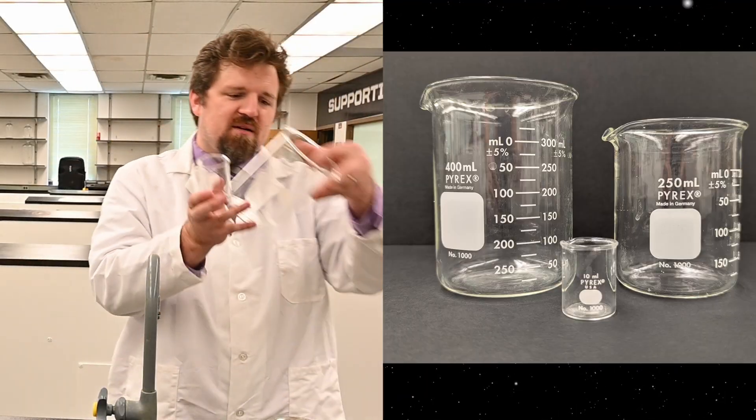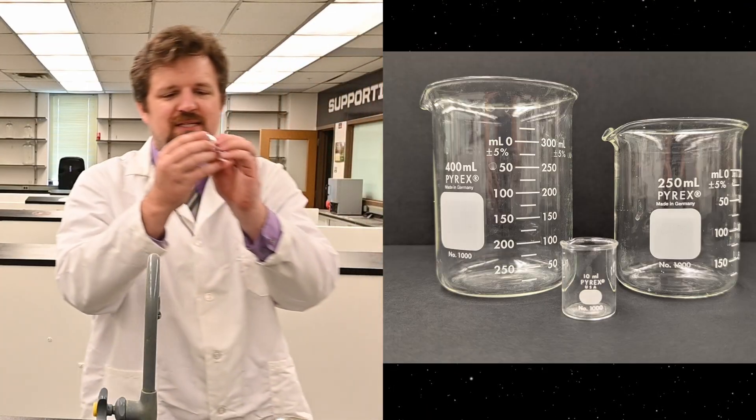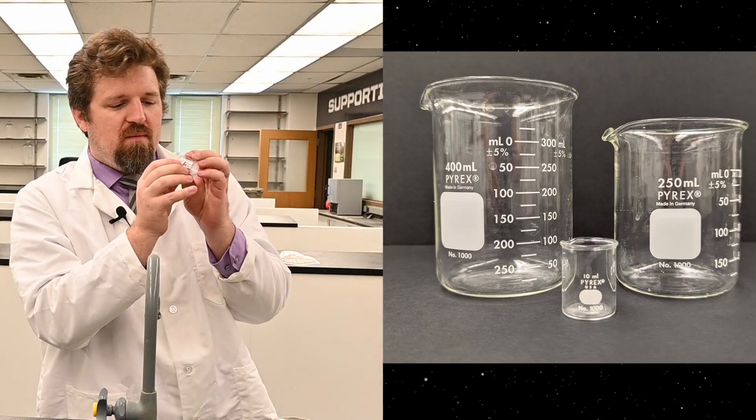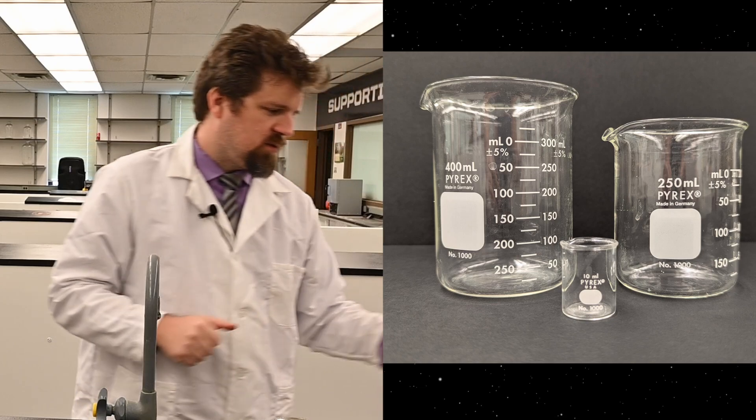So this is a beaker. We've got various sizes. Here's a one liter. Here's a 100 mil. And even these little teeny tiny guys, look at this, look how cute these are. This is a 10 mil beaker. I don't even know why they make them so small.